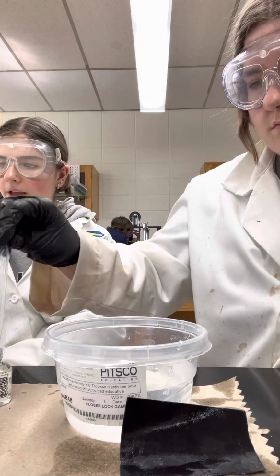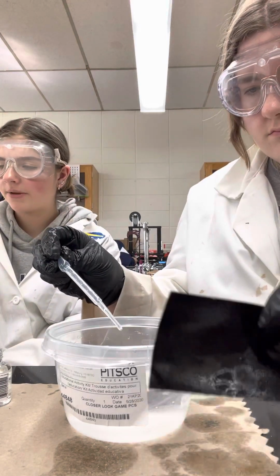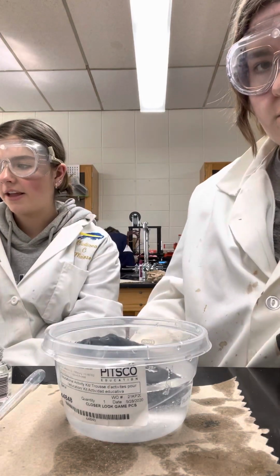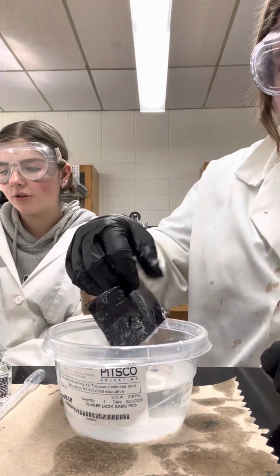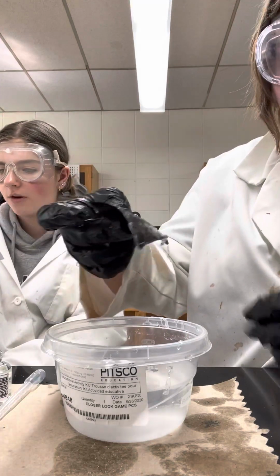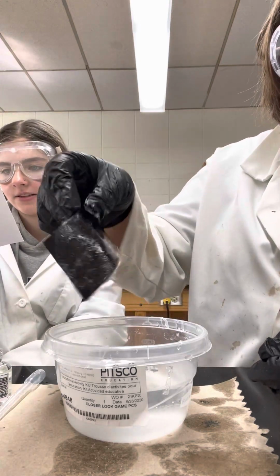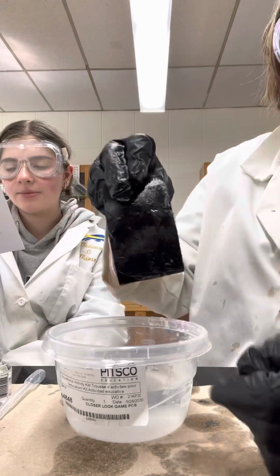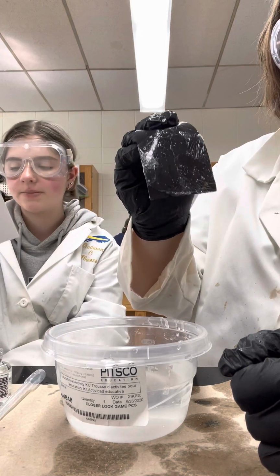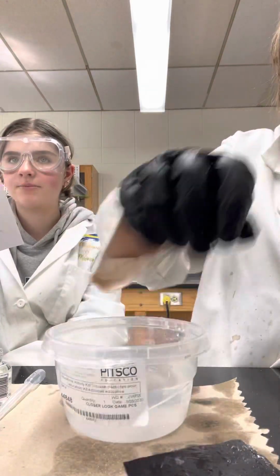If the nail polish dries on top of the water, creating a film, simply pull off the napkin and start over. The nail polish will only stick to paper when it's wet. Observe. Once the paper dries, take it into the light and move it back and forth. What do you notice? Conclude. Based on your observations, was nitrocellulose polar or nonpolar, and why, or can it not be concluded from the experiment? Include whether this agrees with your hypothesis. Conclude. Based on your observations, was alcohol polar or nonpolar, and why, or can it not be concluded from the experiment? Include whether this agrees with your hypothesis predictions.